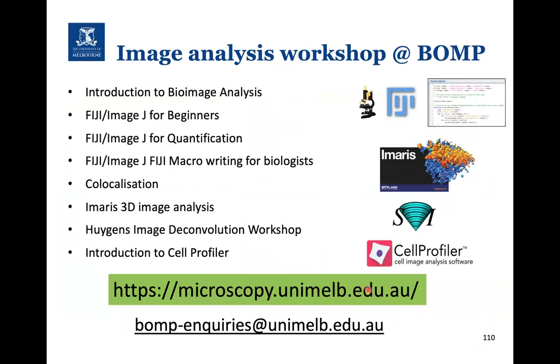The nice thing at BOMP is that we run a lot of workshops that cover these software packages. So I mentioned in the last couple of months, we've run our Intro to Bioimage Analysis lectures. We've run our Fiji for beginners, our Fiji for quantification. We've also run an Introduction to Cell Profiler. These other workshops, so the Fiji macro writing, Colocalisation, Imaris, Huygens, they're planned for later on in the year, but haven't been open for registration yet. If you've missed any of these workshops, then they are available on our website. Or if you're having difficulty tracking it down, just send us an email to this mailing list.